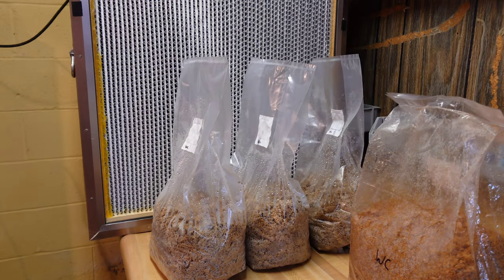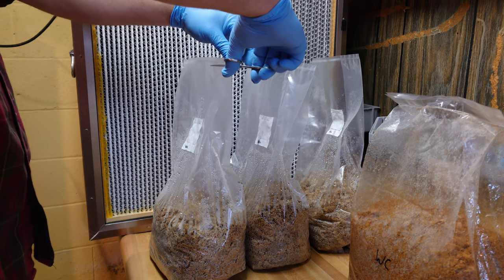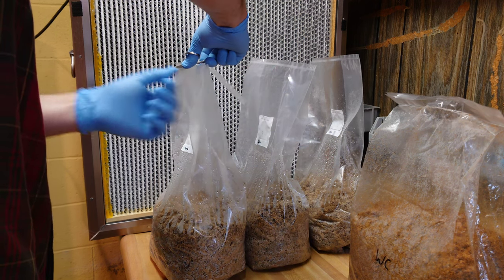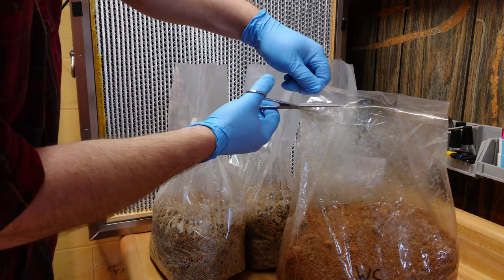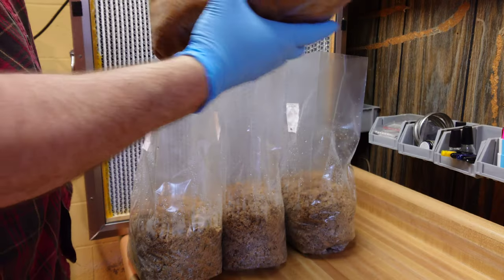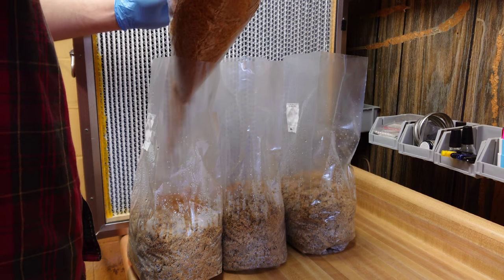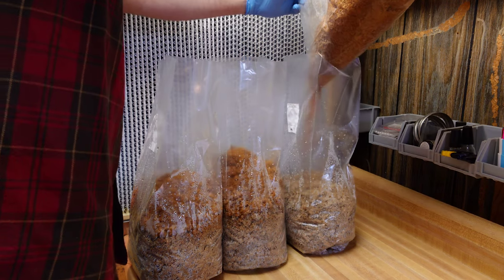Starting with our wine caps, we're going to carefully cut the tops off each of our bags, including our master spawn bag. Everything — including my gloves and the scissors — has been sprayed down with 70% isopropyl. It's important to keep everything as sanitized as possible. The goal is to evenly distribute the spawn from our master bag into our three bags — it doesn't have to be exact, but get it as close as possible.